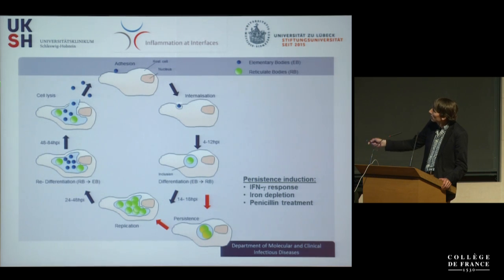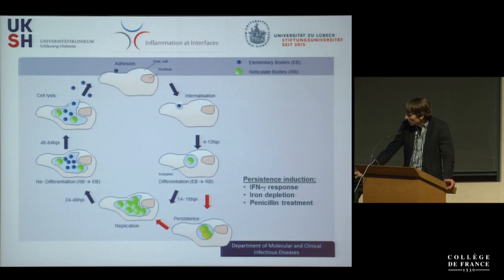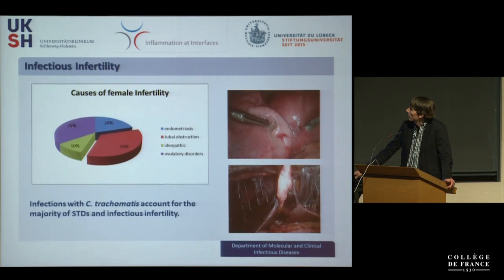And the metabolic background of all that is not known, and the difficulty is quite obvious. How can you decipher between the cellular metabolism and the chlamydial metabolism, because it's directly linked together? And that was the reason why we thought about doing imaging techniques first, namely 2-photon microscopy, to try to get a little bit more insight into where the metabolics is coming from.